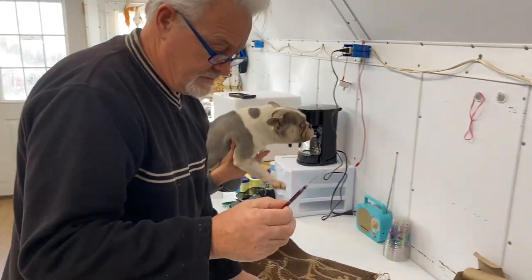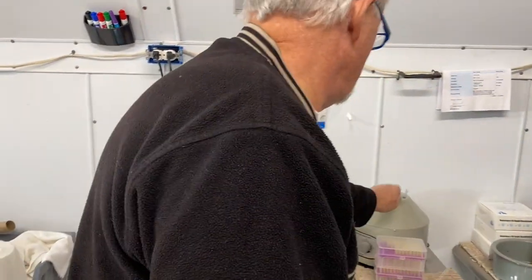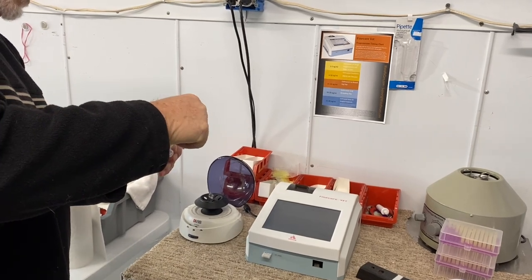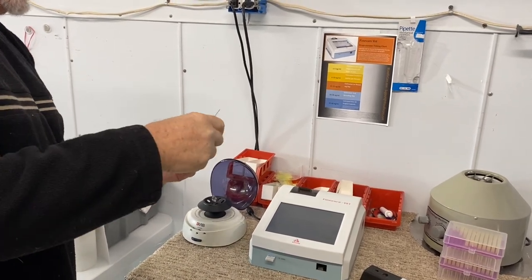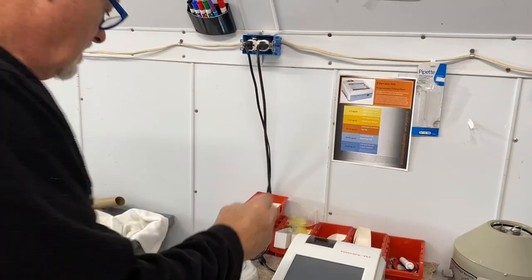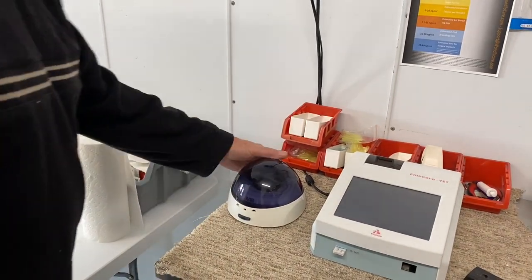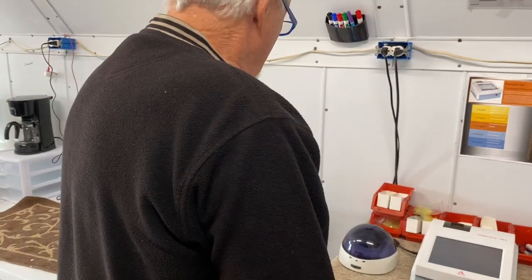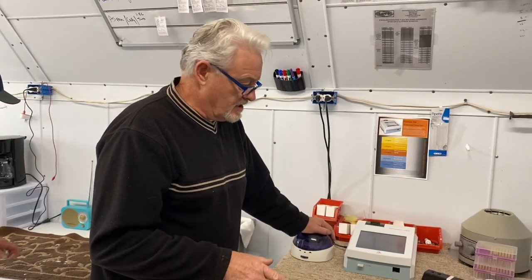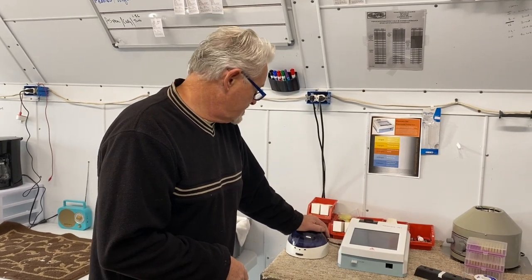So now we get to spin this down. I could use this one — this is the one we sell, but it's noisy as heck — so I'm going to put it in this quieter one while I'm talking. You should probably put a cap on the needle so nobody gets stuck with it. You should let that blood sit for a bit before you spin it so it coagulates a little bit — you'll have a better result. But for the sake of getting things done, we're just going to spin it quickly.